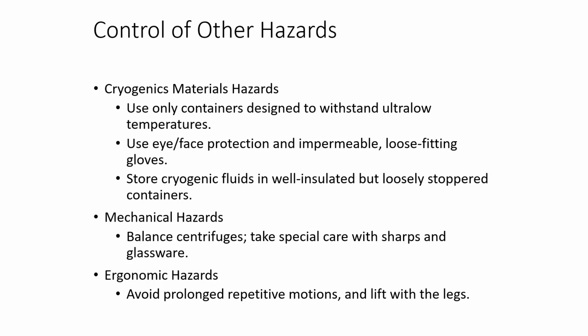Take special care with sharps and glassware. And then there are ergonomic hazards, which come with working in any type of job. You want to avoid prolonged repetitive motions, and you always want to lift with the legs.